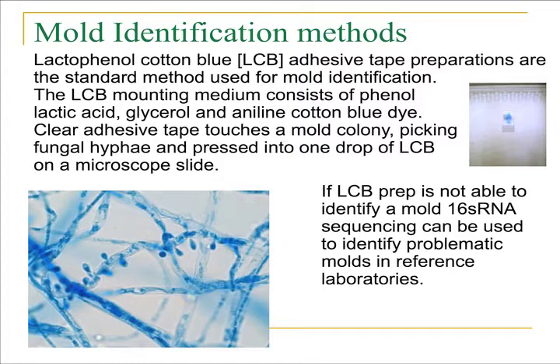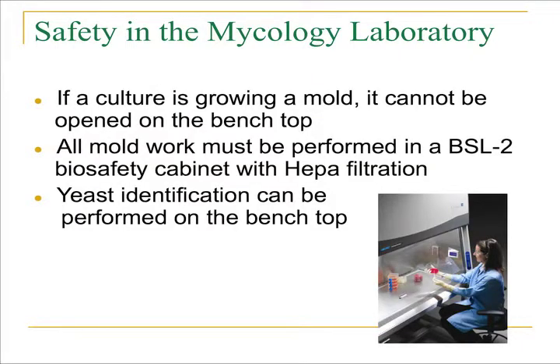On the next slide is pictured the safety precautions for use in a mycology laboratory. As you can see, the person is doing the work in a biosafety cabinet. This is a BSL-2 biosafety cabinet and will have HEPA filtration. This is very important when you're working on mold cultures. Mold cultures should never be worked on a benchtop. The conidia and hyphae can disseminate into the laboratory and be dangerous to laboratory personnel. With yeast, you do not have to maintain the same precautions. Yeast are not disseminated throughout the laboratory and can be worked on a benchtop.